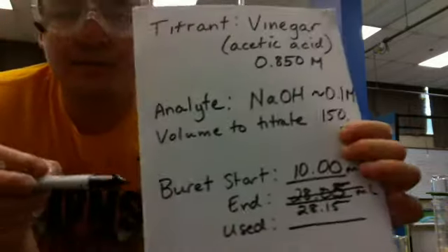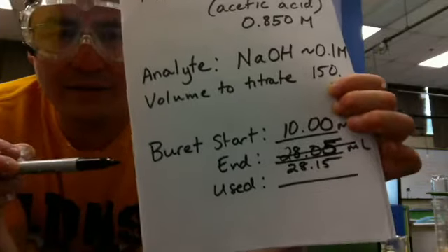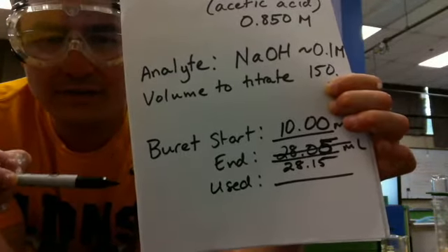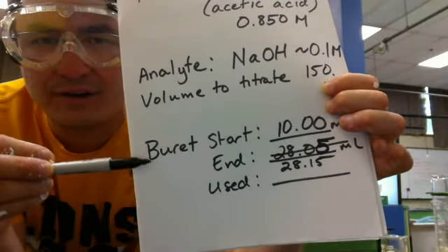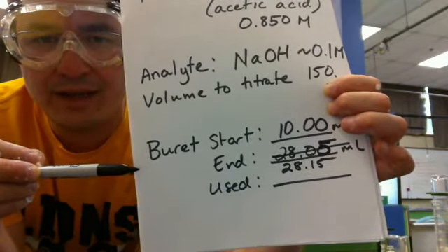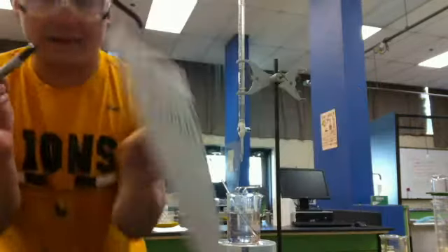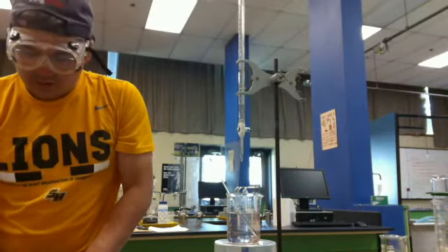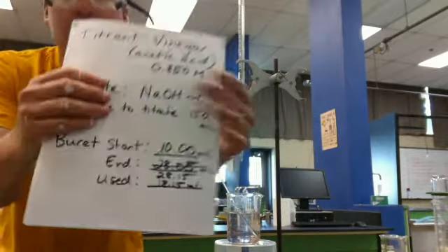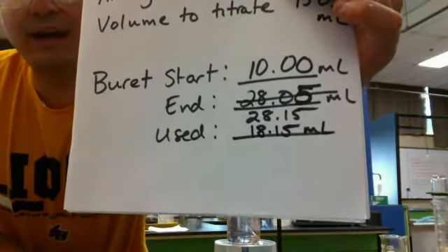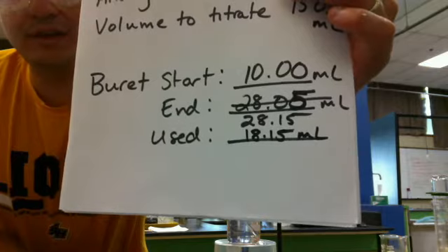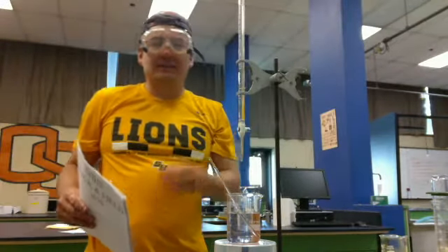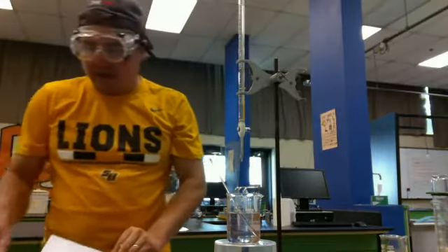So to find the amount of sodium hydroxide that I, or sorry, vinegar that I used, I'm going to subtract my ending amount. I'm going to take my start amount from my end amount. So 28.15 minus 10, I used 18.15 milliliters. So I used 18.15 milliliters of vinegar to neutralize that. So I didn't quite use the 20 that I had estimated, but it was pretty close, and this is much more precise.